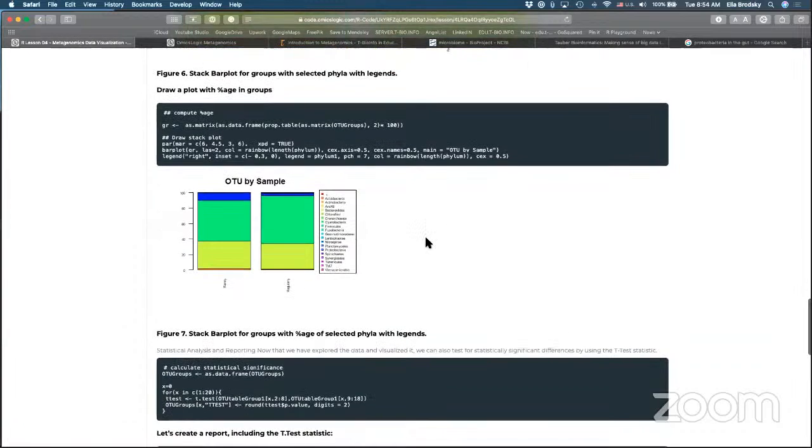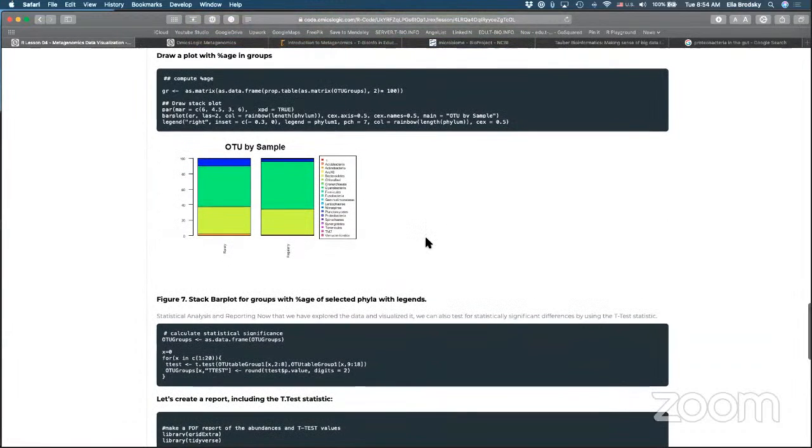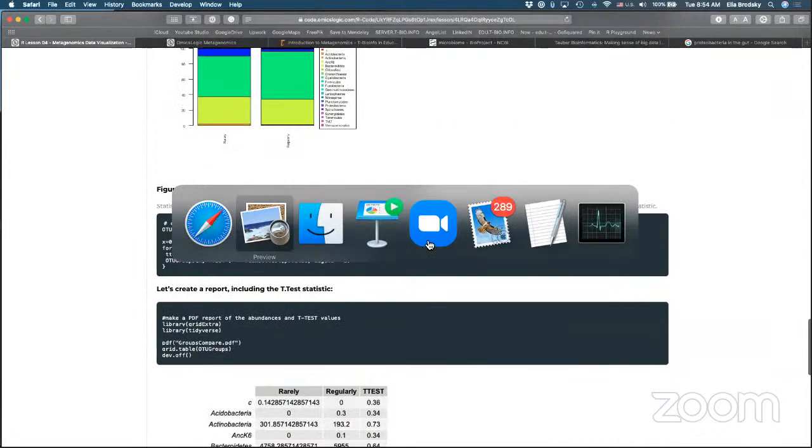So all of these are important downstream steps to be able to ask the question, what is the difference if we identify groups of samples, and how do we know for sure that these are differences that are statistically significant between groups of samples?